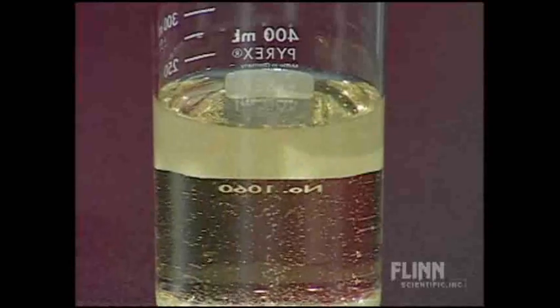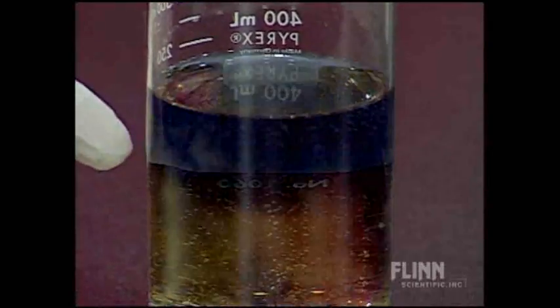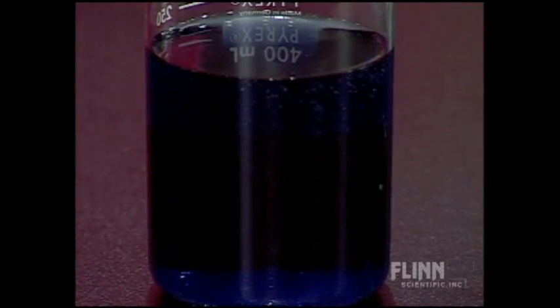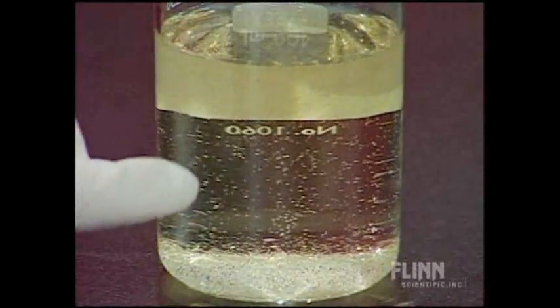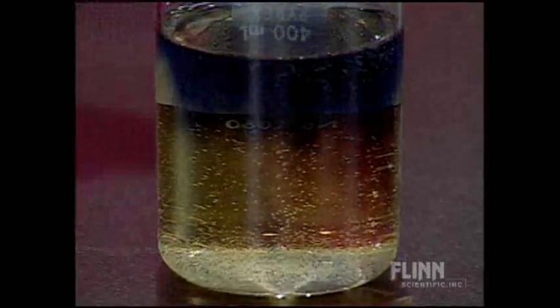I don't know if you can see that up close, but if you look at it, we have produced some gas in there. It's hard to see when it's dark. I can see it up close here, but let's see when it goes colorless. Do you see some gas bubbles being produced in there when it's yellow?